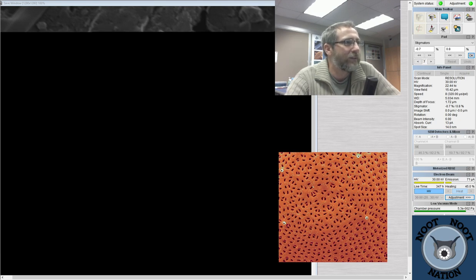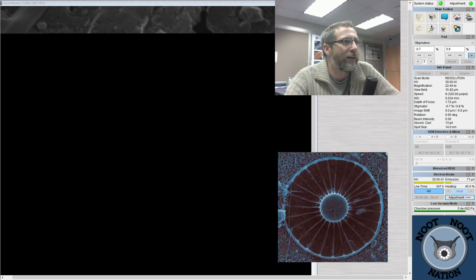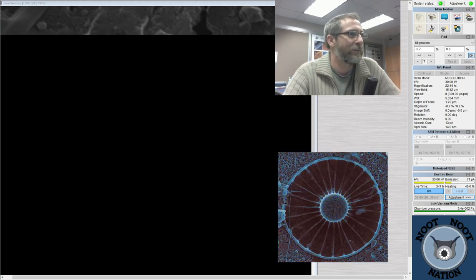Glacionema. Oh, it could be. Sorry. I guess you're pretty high vacuum to get these electrons to scan. Yeah, everything has to be in a really high vacuum.